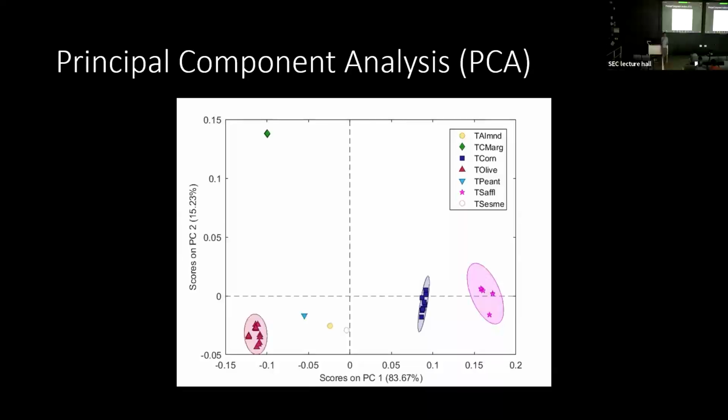But so the changes in the biomarkers are in the peak positions or the peak amplitudes or the ratio of the peak amplitudes. And the surface enhancement is just lowering your detection limit to get down to physiologically relevant concentrations. Does that help?